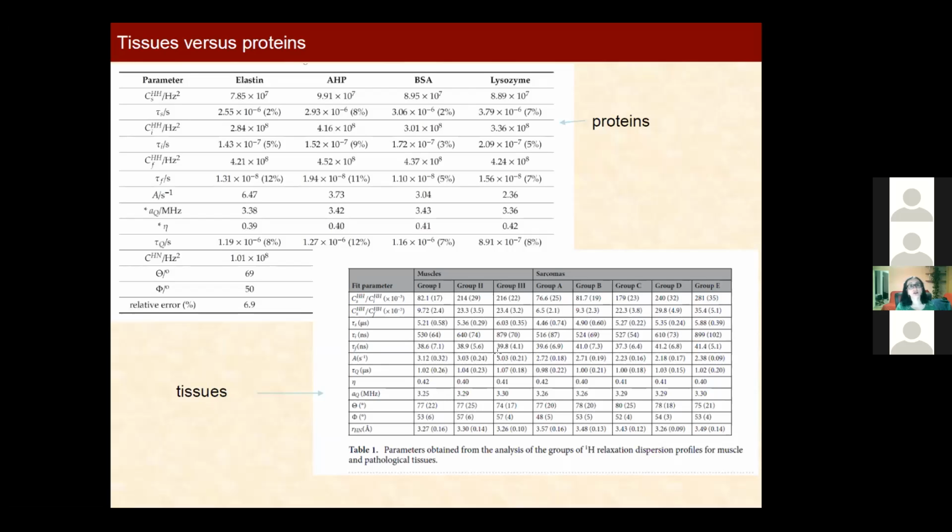Because actually I always have the fast process, and in the fast process with a large dipolar relaxation constant in front, the curves will be rather smooth. If the dipolar relaxation constant for the slowest process prevails, the curve will be quite steep. However, I don't know whether this is surprising or not, but it might be worth noticing.